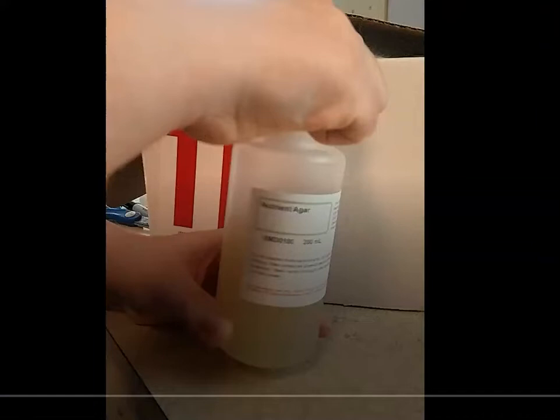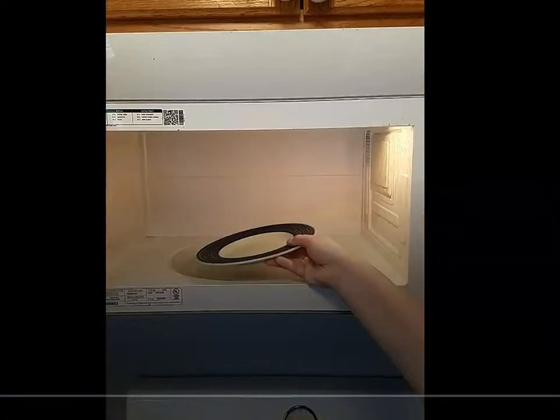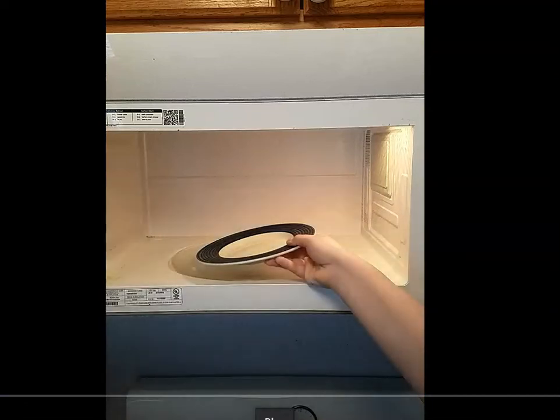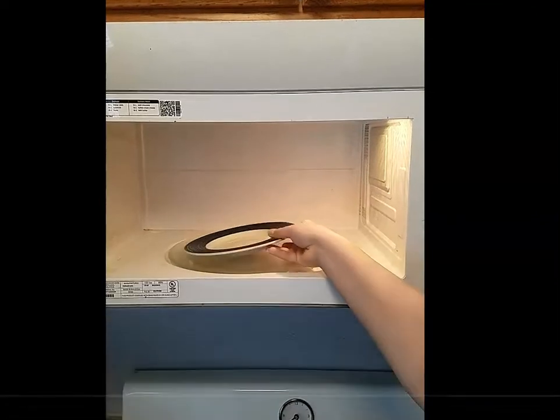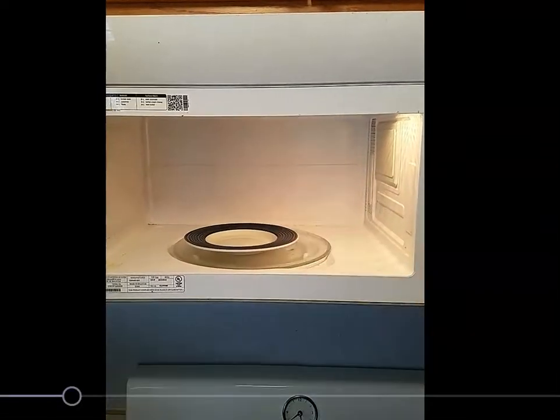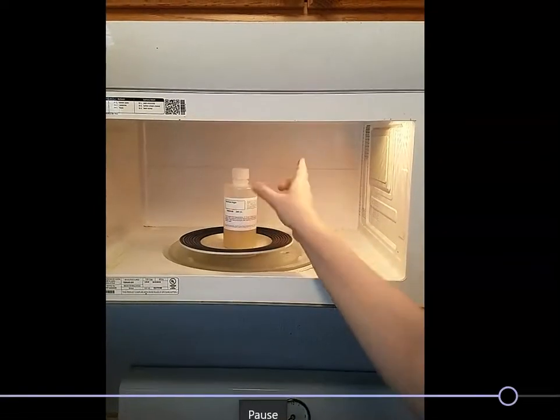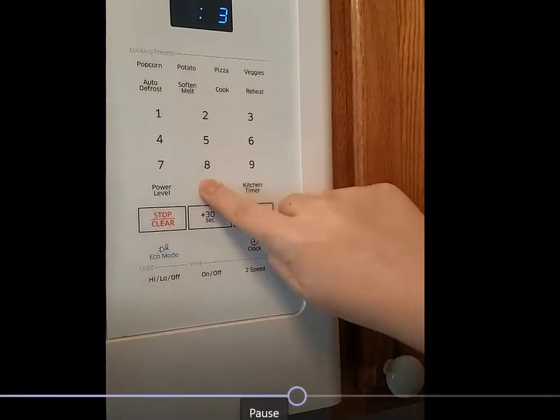The first thing you're going to do is take the nutrient agar out of the kit and loosen the cap. There's more than one method you can use — you can use a hot water bath with boiling water on the stove, but that takes about 25 to 35 minutes. So I'm going to recommend doing it in the microwave. You put a plate down in the microwave first, and then you place the bottle of nutrient agar with the loosened cap on top of the plate, and set the timer for 30 seconds on high.